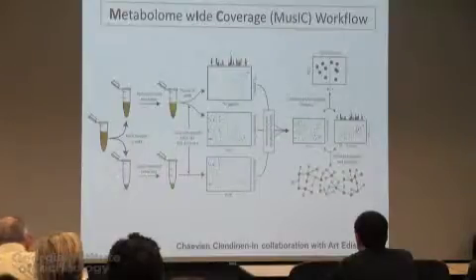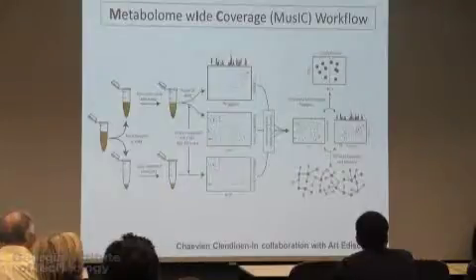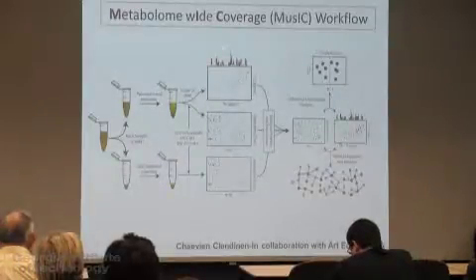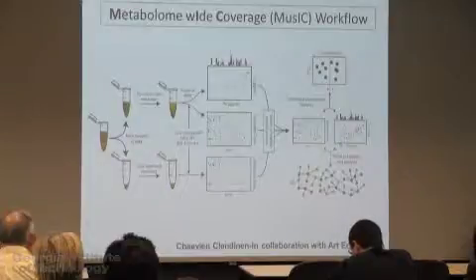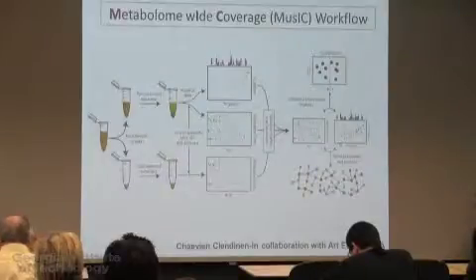The less polar fraction, we apply a lipidomics protocol. This is the expertise of Al Merrill's group and Cameron Stollar's group. It's basically specifically for lipids. This fraction, the more polar group, we split it in two. And what we're doing now is we're starting to do NMR. This is together with Art Edison at UGA. And we're also splitting it to do a separate type of mass spec just for the polar fraction. So you see there's a lot of work involved in this.